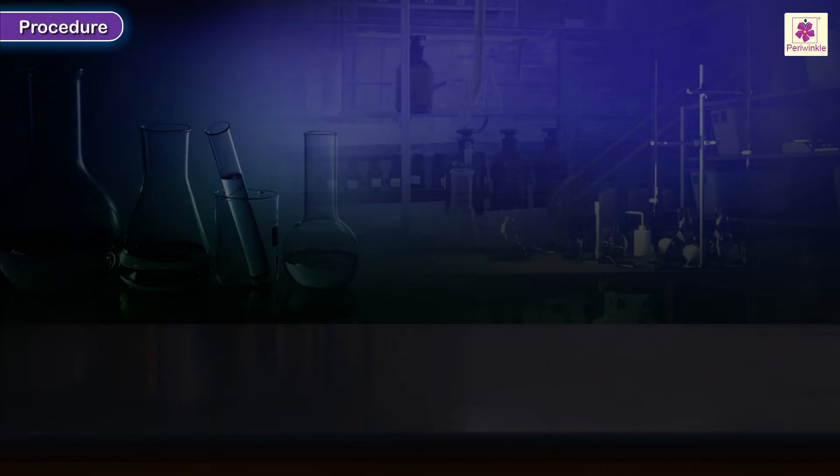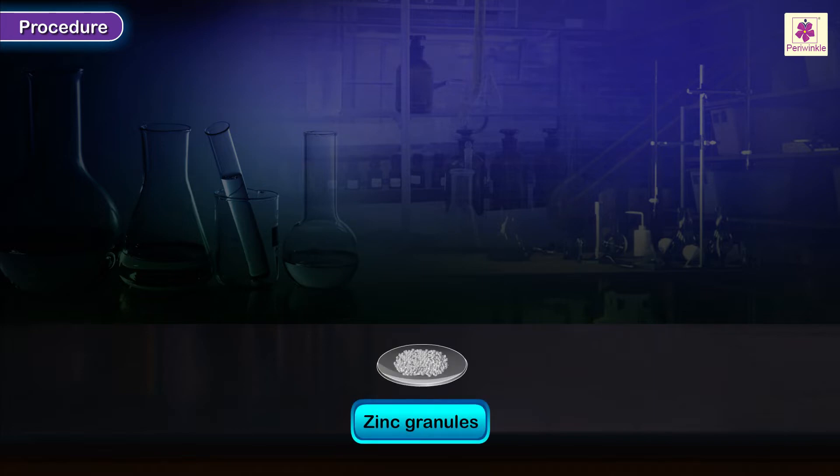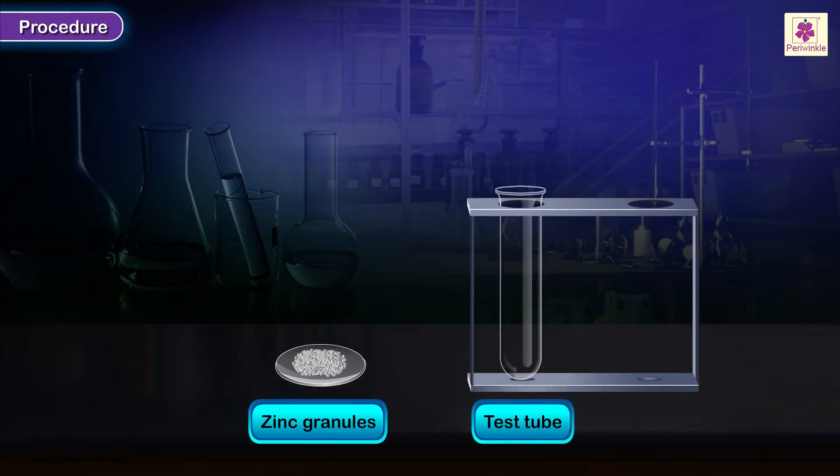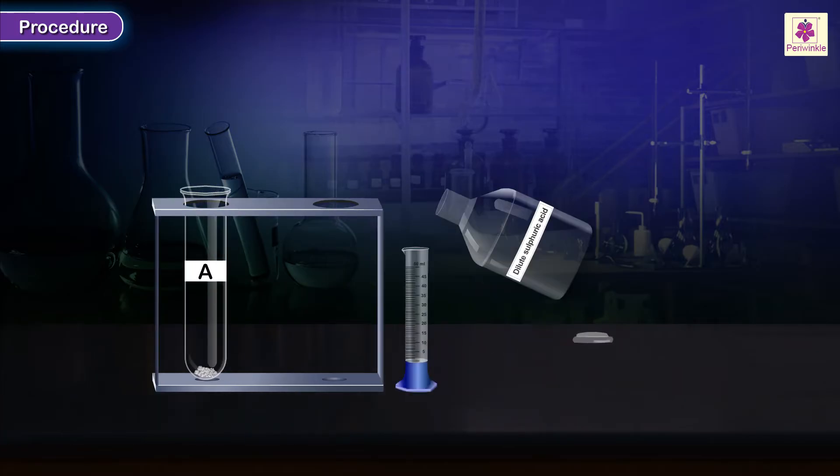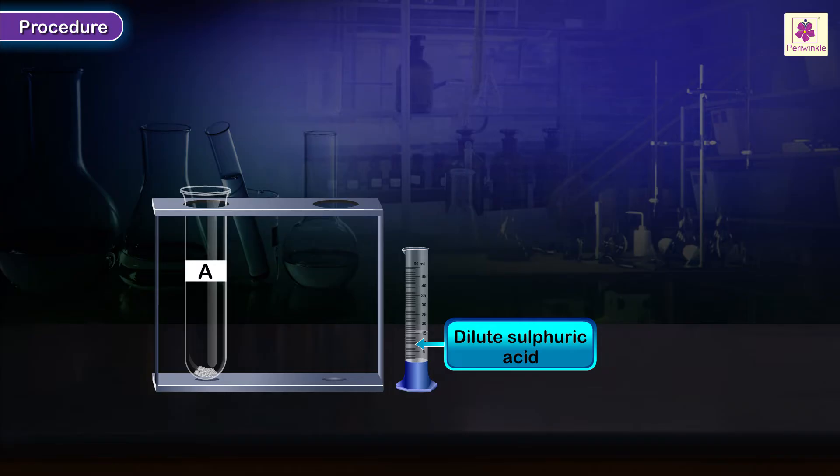Procedure: Thoroughly wash the given zinc granules and take a few of them in a hard glass test tube labeled A. Carefully add about 10 to 15 ml of dilute sulfuric acid to it.